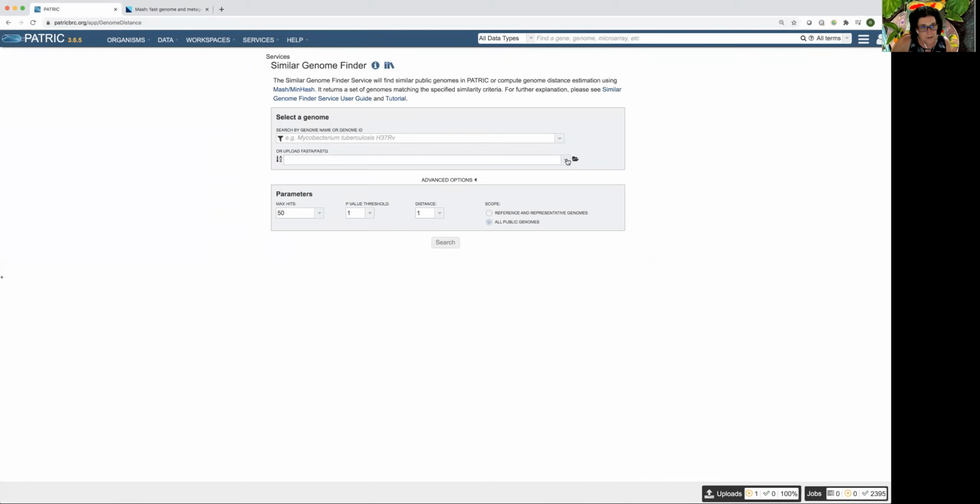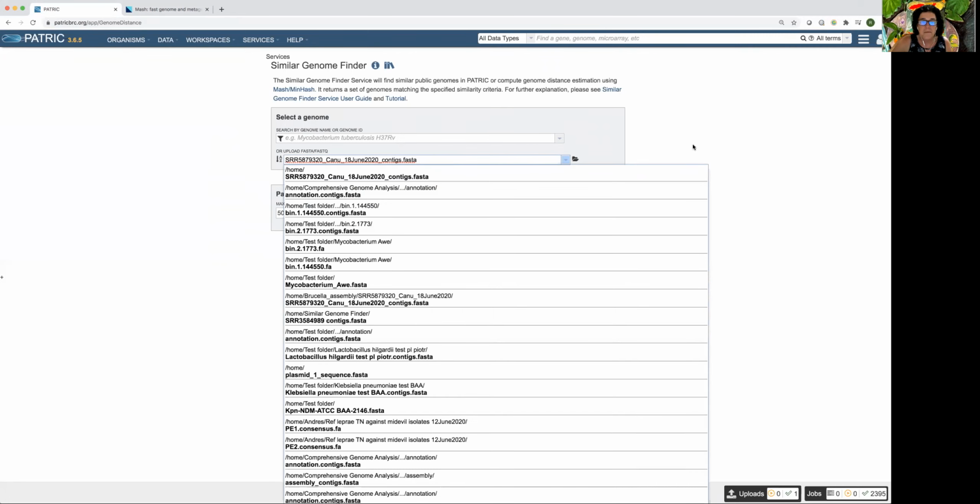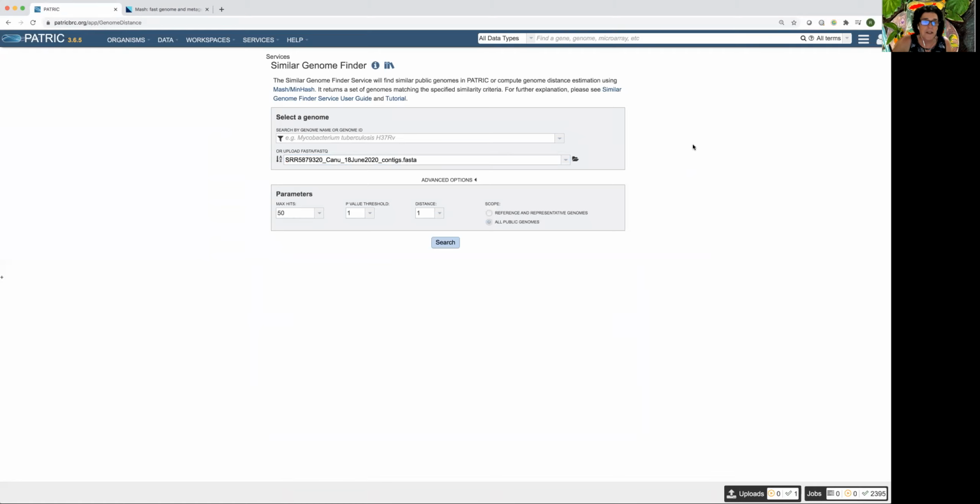Once it's uploaded, there it is. I see it here in my file. So I'm ready to figure out who this is. I could search right now, but I just want to point out that you can select the number of hits. You can filter on p-value threshold.